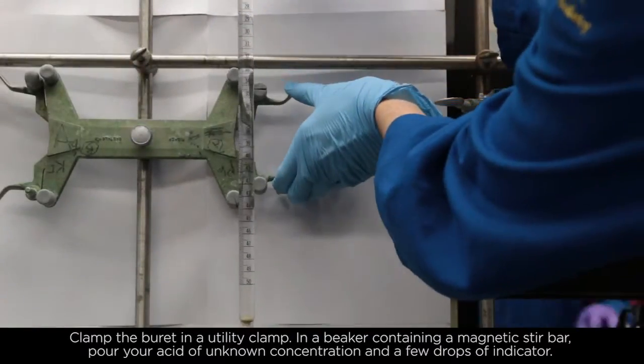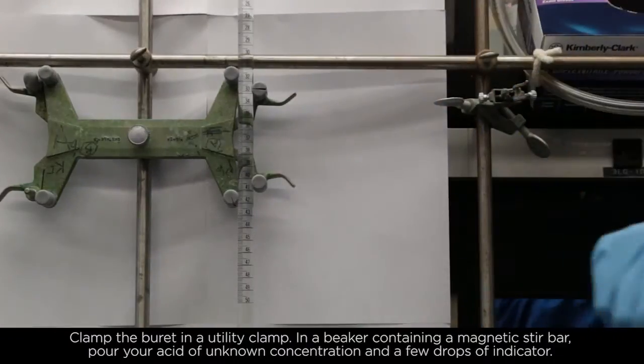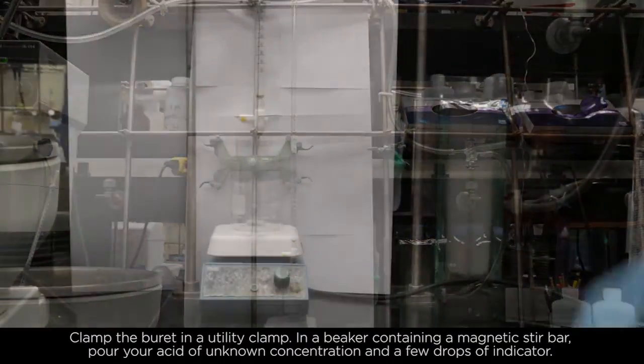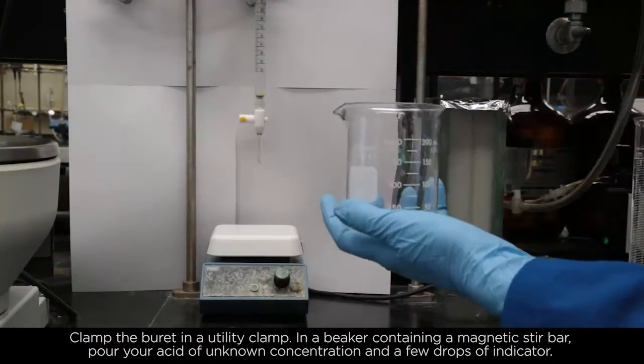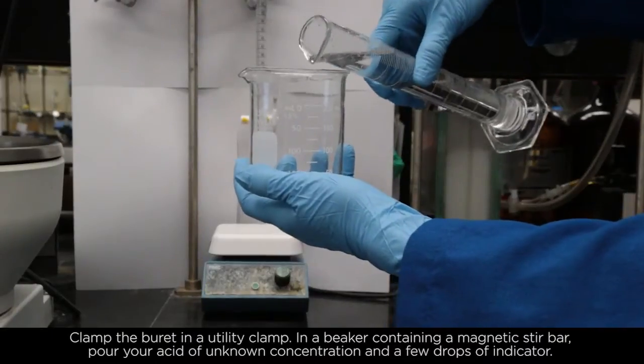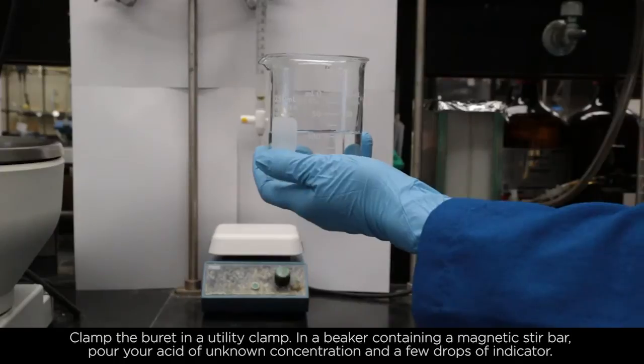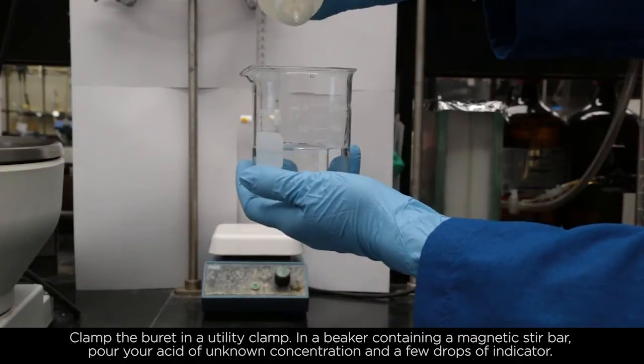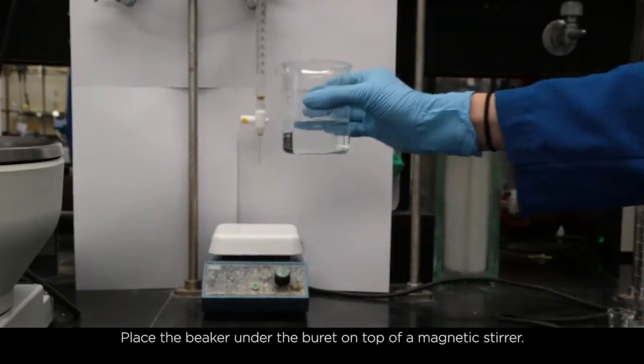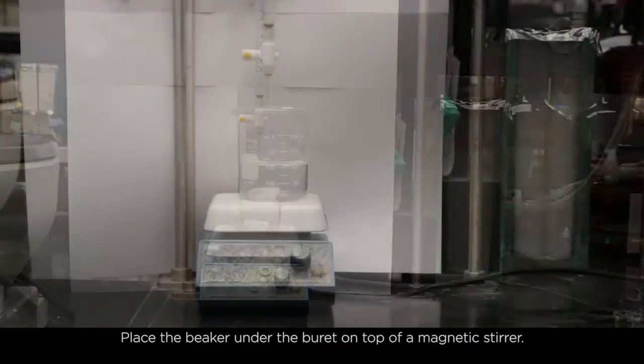Clamp the burette in a utility clamp. In a beaker containing a magnetic stir bar, pour your acid of unknown concentration and a few drops of indicator. Place the beaker under the burette on top of a magnetic stirrer.